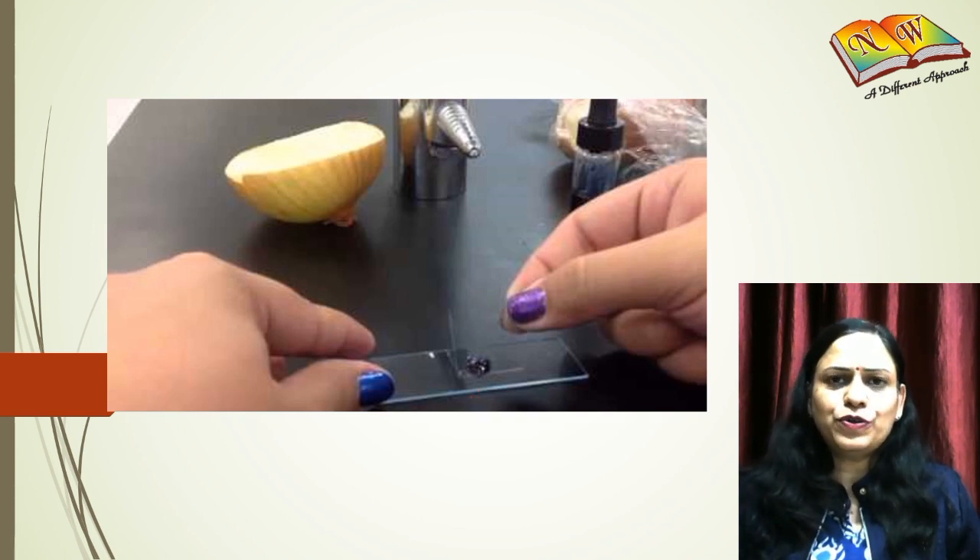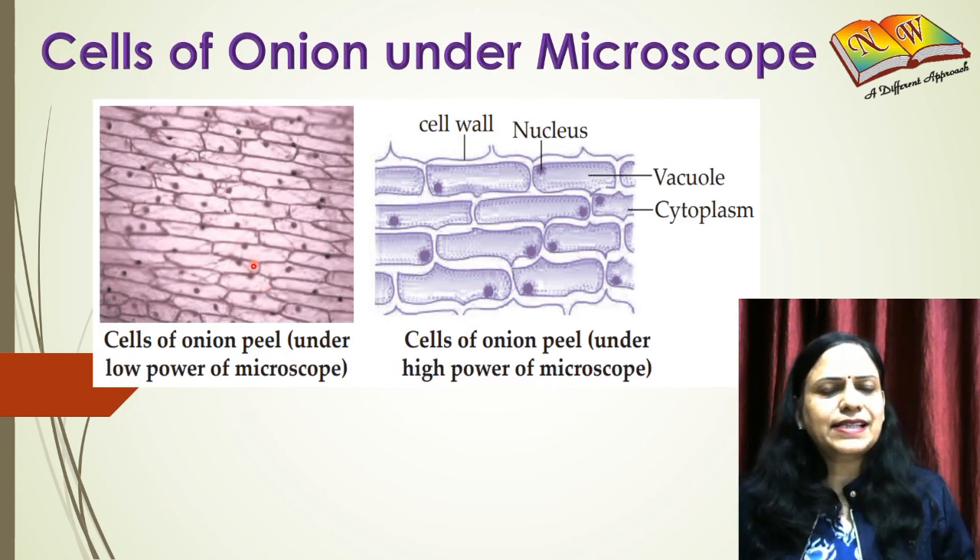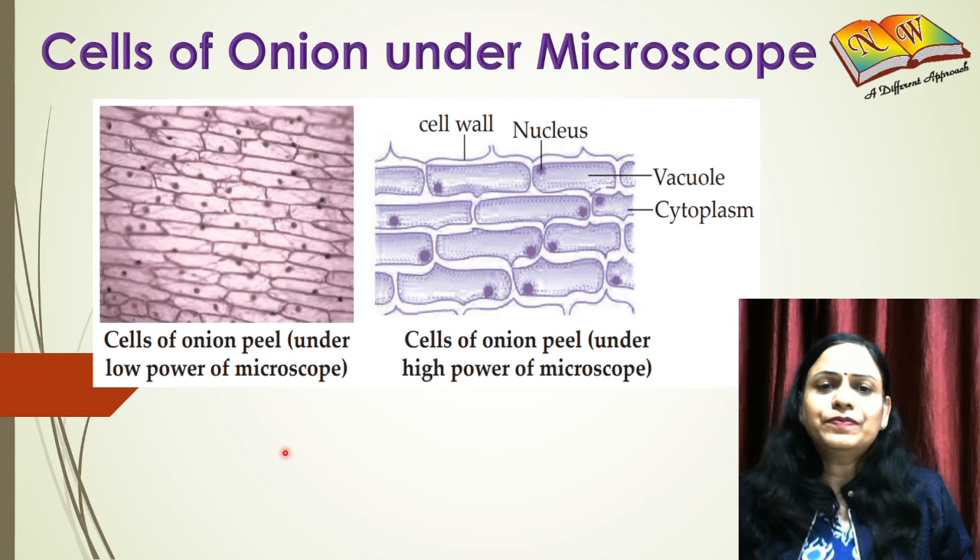When you observe the slide, this is what you see — this kind of structure: the cells of onion under low power of a microscope. You will very clearly be able to identify the nucleus. The small dots you are seeing here are the nuclei, and the outer boundary of the cell is the cell wall, which is a characteristic of all plant cells. Using this onion peel cell slide, you can easily observe the cell wall as well as the nucleus of a plant cell.